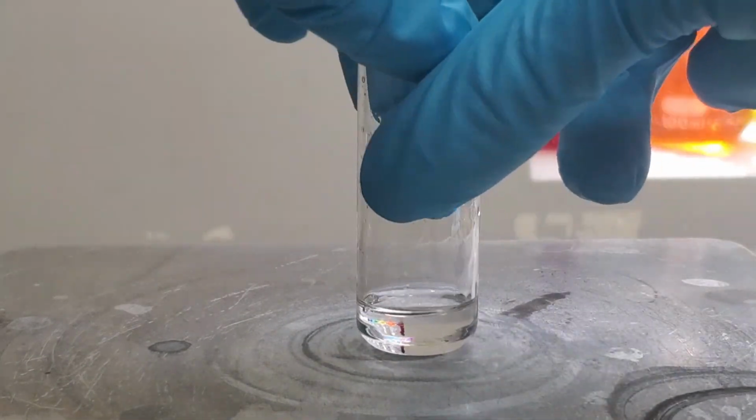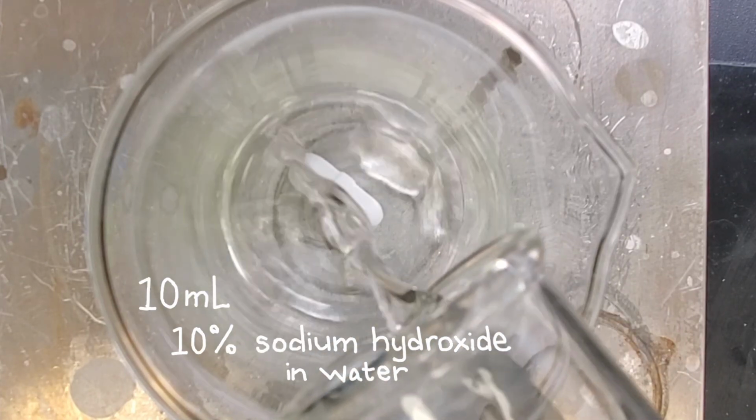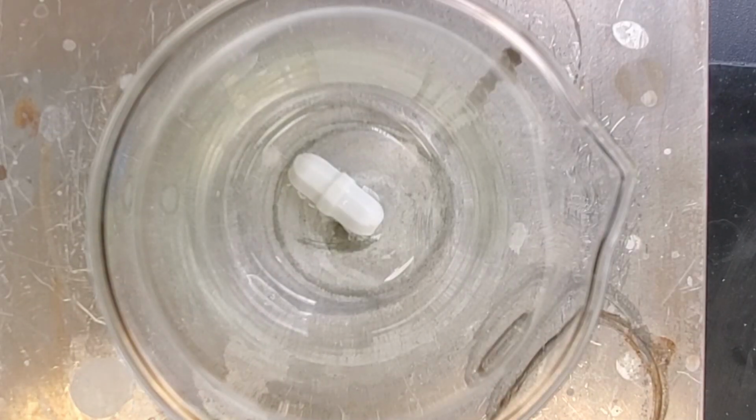In a separate beaker, I added a stir bar, then 10 milliliters of 10% sodium hydroxide in water, followed by 1 milliliter of ethanol. The sodium hydroxide provides the basic conditions needed for the aldol condensation, and the ethanol helps the organic reagents mix more evenly in solution.